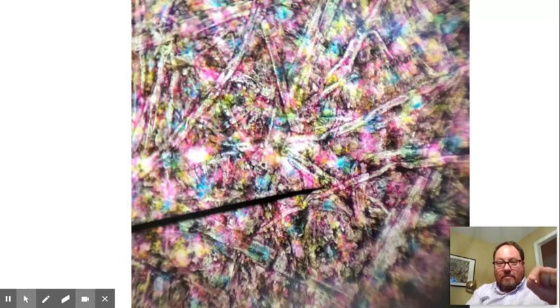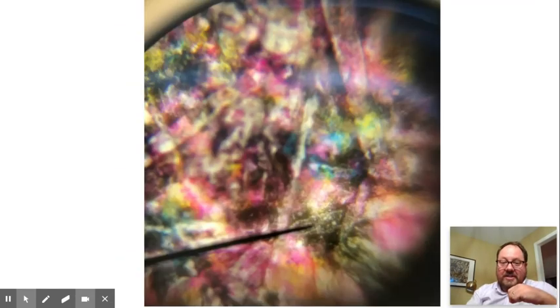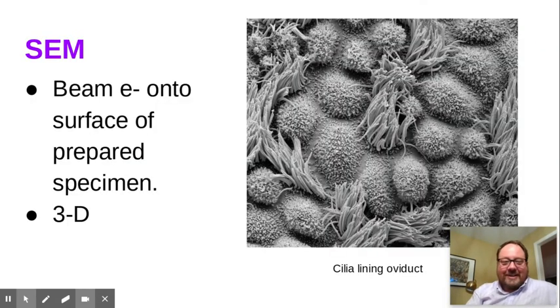If we back out even more, it looks like there are lighter and darker regions. It's sort of rough to make out, almost looks like stippling. But you can see almost like a nose and mustache, maybe a mouth. If we back out even further, hey, we have Mr. Cook. So that's what you can do with microscopes. You can take images and get progressively finer and finer detail looking at what's going on. I don't think he knows that I put that in the lecture.